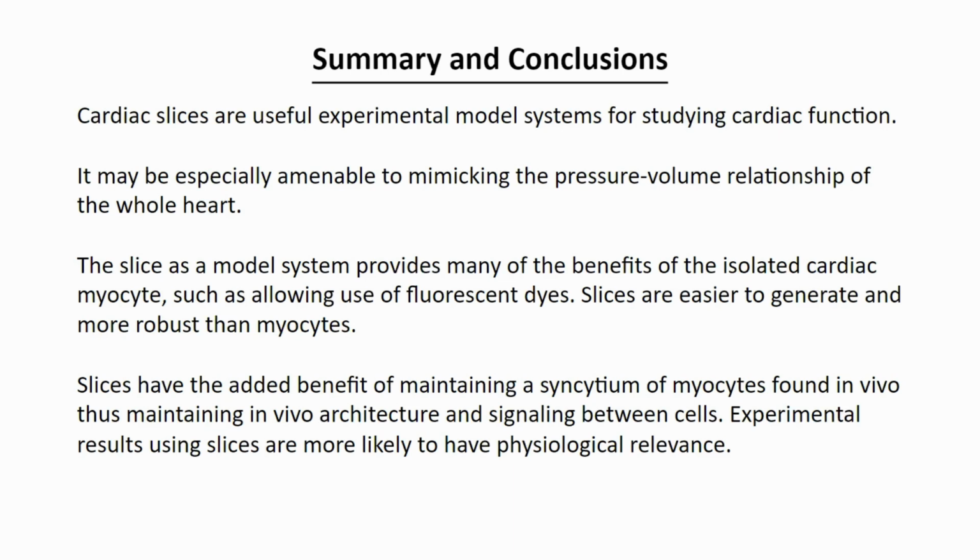And slices have the added benefit of maintaining a syncytium of myocytes found in vivo, thus maintaining in vivo architecture and signaling between cells. Experimental results using slices are more likely to have physiological relevance.